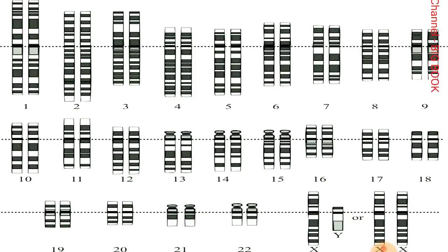Well guys, you can see in this karyotypic complement which has been already arranged, it is of the Giemsa staining technique, where you can see that 1, 2 and 3 are of the same size, that is, the sizes of the chromosomes are similar, and approximately all the centromeres are metacentric.